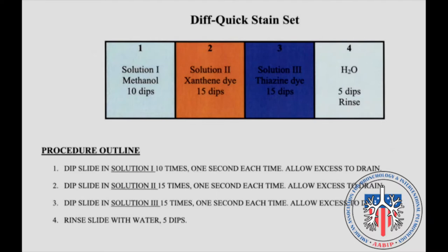After each dipping, the excess is allowed to drain. The slide is then rinsed in tap water 5 times.